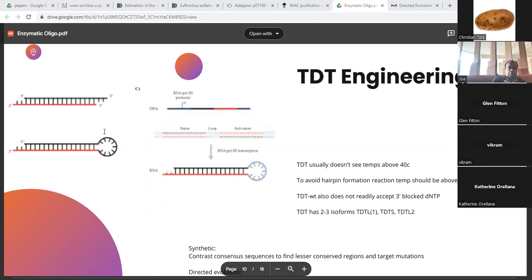Okay, so over on this side, like I mentioned before, at lower temperatures there's a good chance that hairpins will be formed after a certain length. And that length is kind of up to chance, depending on how rich your sequence is, and a lot of luck on top of it. But generally, you can't print more than about 200 to 300 nucleotides before you run into a hairpin that just breaks all activity.